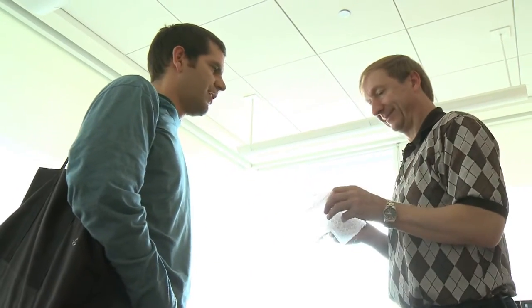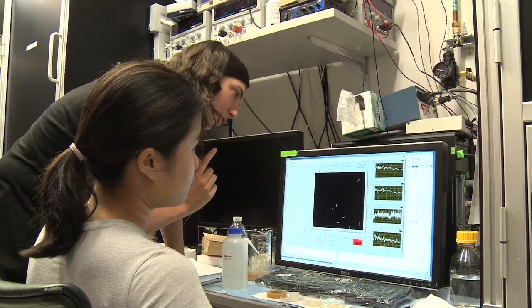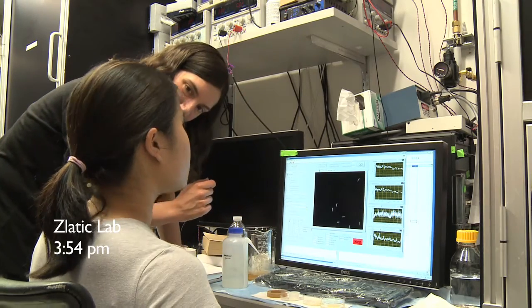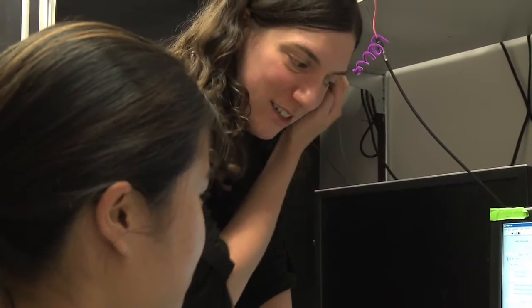You don't have time to play with it today — I am doing other work. After this one, we'll actually watch one of them and watch them move. With the puff, do you see them shifted to the side? That's great, that's really cool.